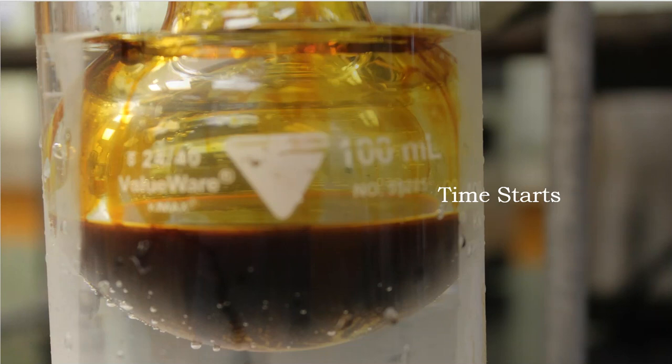So in the lab procedure, it tells me, once you've added your iodine and THF, that's great. Your hexene is in here. Your THF is in here. Let me write these on here. Your hexene is swimming around. Your THF has joined the party. Your iodine is now floating around in here too, like Jaws. Boom, boom, boom, right? And it's getting ready to attack the hexene.